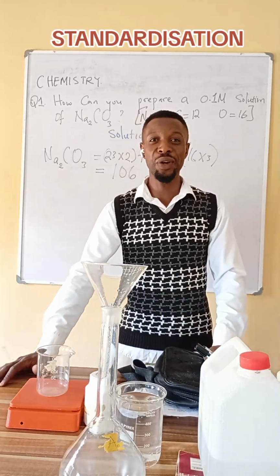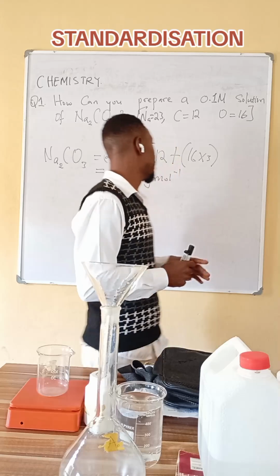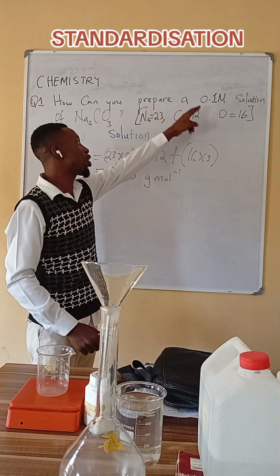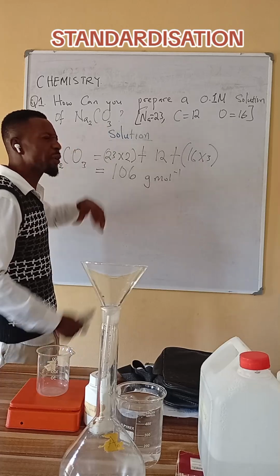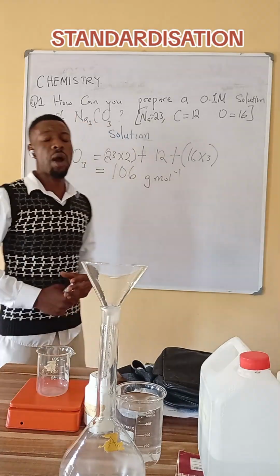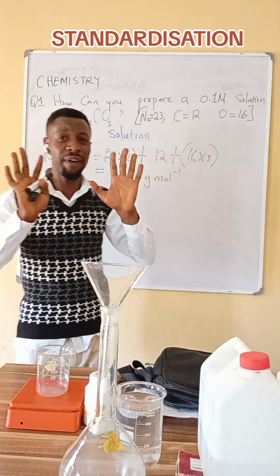Standardization. In this tutorial, we shall be talking about preparation of standard solutions. And here on the board, we have a question. The question reads, how can you prepare a 0.1 molar solution of sodium carbonate? How can you prepare a 0.1 molar solution of this given reagent? Now, to prepare a standard solution of this exact concentration, it's very simple and very easy.